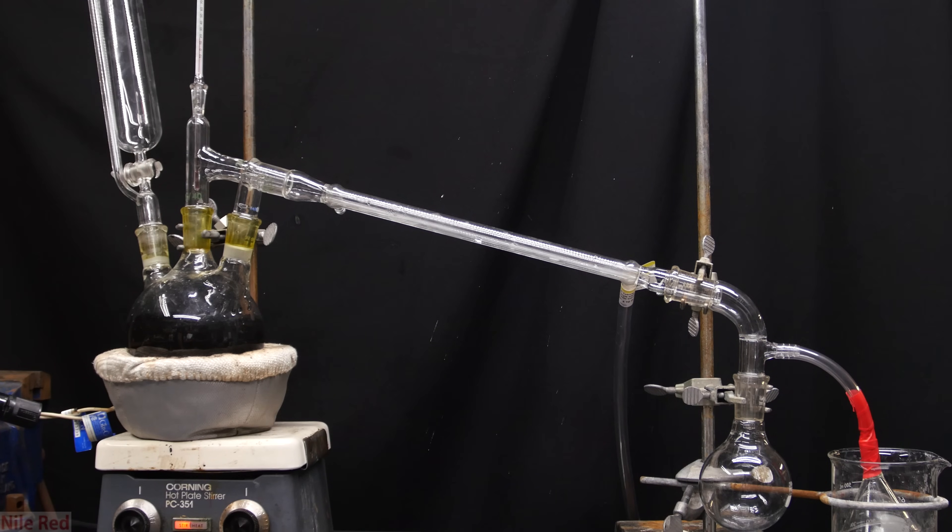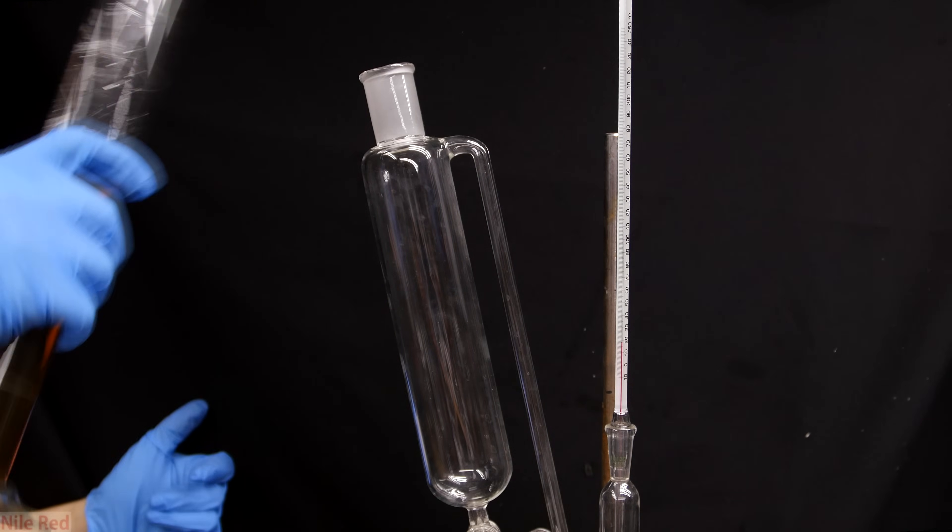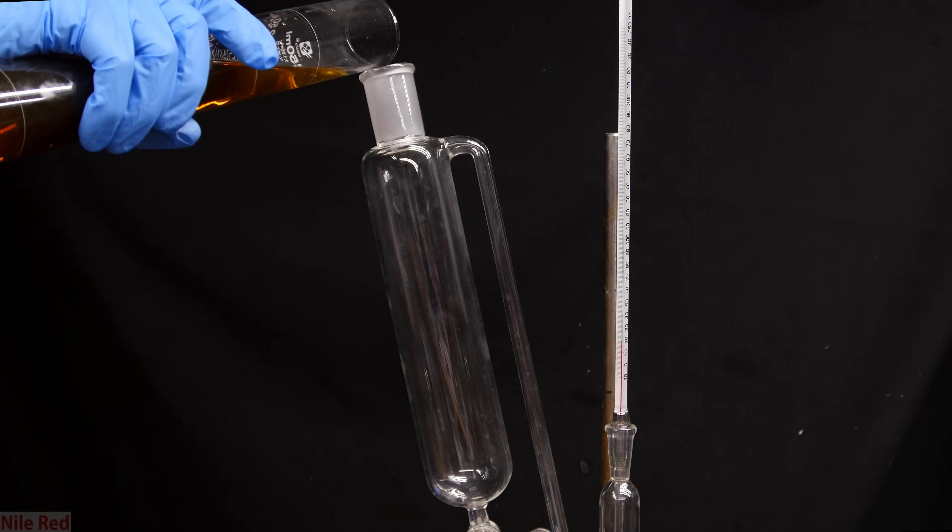This is what the apparatus looks with all of the joints sealed, and if you look to the left, you can see that there's an addition funnel attached. To the addition funnel is where we add the 186 milliliters of the drain cleaner.